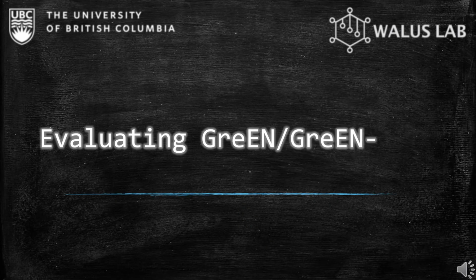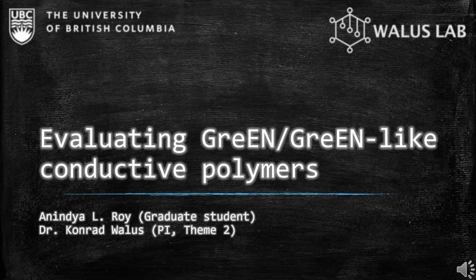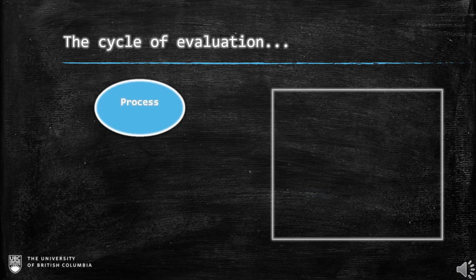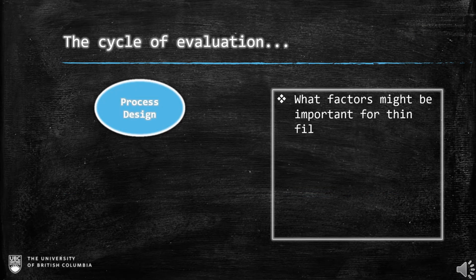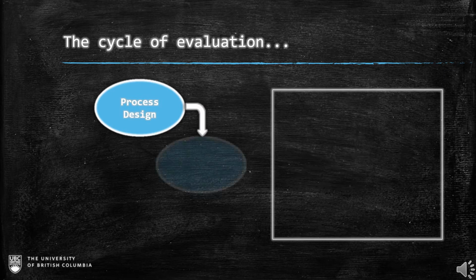Welcome to this brief video on the evaluation of GreEN and GreEN-like conductive polymers using combinatorially formulated inkjet printed thin films. Our thin film evaluation experiments consist of the process design, which includes identification of factors affecting thin film performance, material assessment, and choice of thin film library preparation methodology.